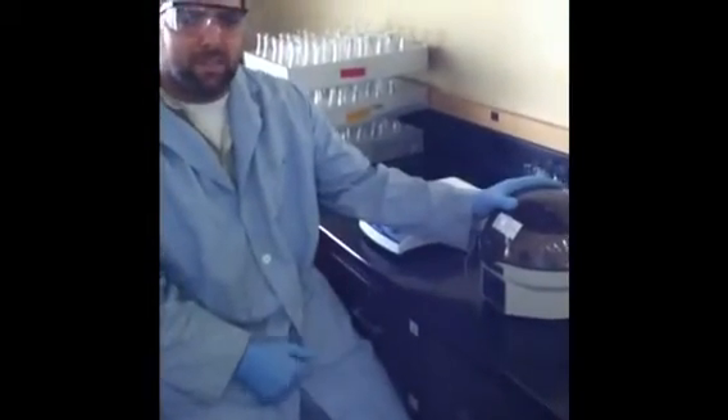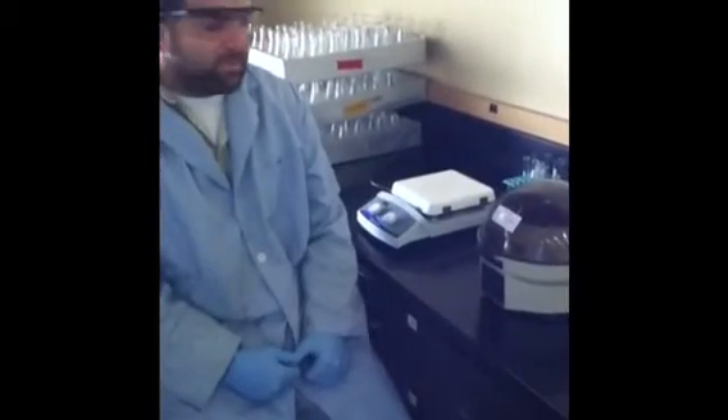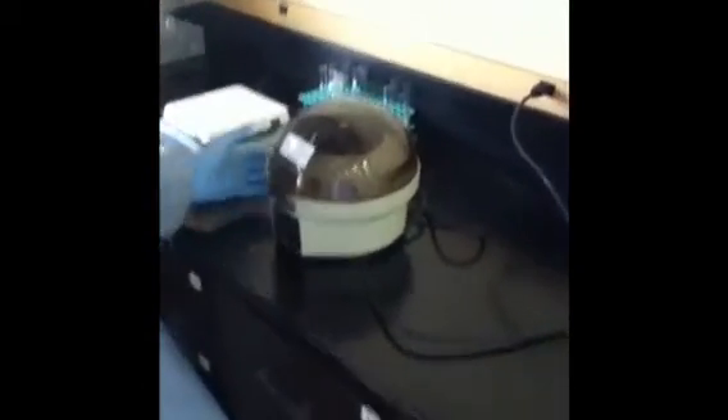The centrifuge has now stopped, so we're waiting for it to completely stop rotating before you open the lid. Make sure it completely stops, or else you can cause damage to the centrifuge.